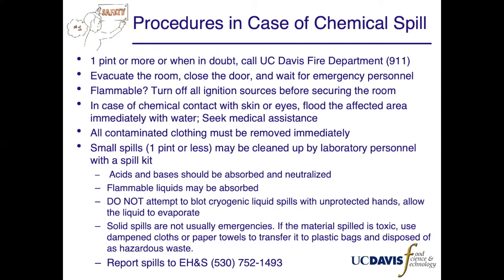Solid spills are not usually emergencies. If the spilled material is toxic, use dampened cloths or paper towels to transfer it to a plastic bag to dispose of as hazardous waste. Please also report all spills to EH&S at 530-752-1493.